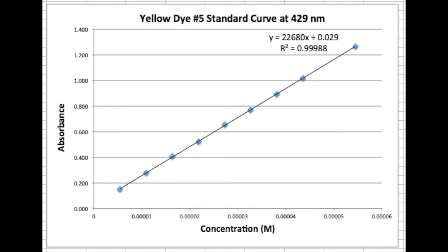Hunter, Alec, and Roberto just walked you through all the steps necessary for creating a standard curve. Feel free to go back to any section for further clarification. Your final curve should look something like this.